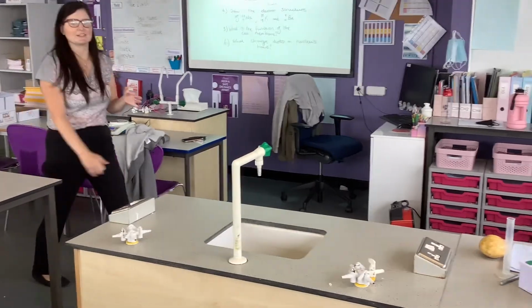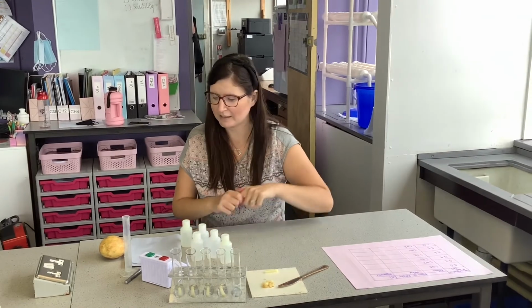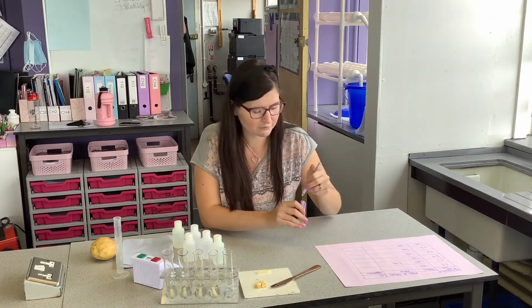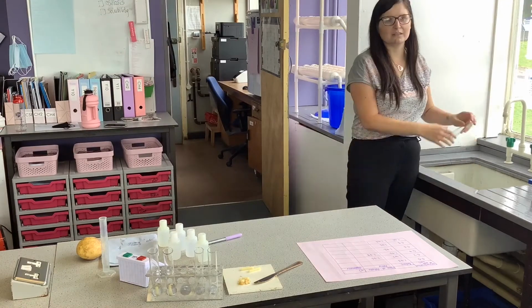My potato has actually gone up in weight. So now my potato is weighing at 1.55 grams. And I'll do the exact same for all the potatoes and I'll get back.